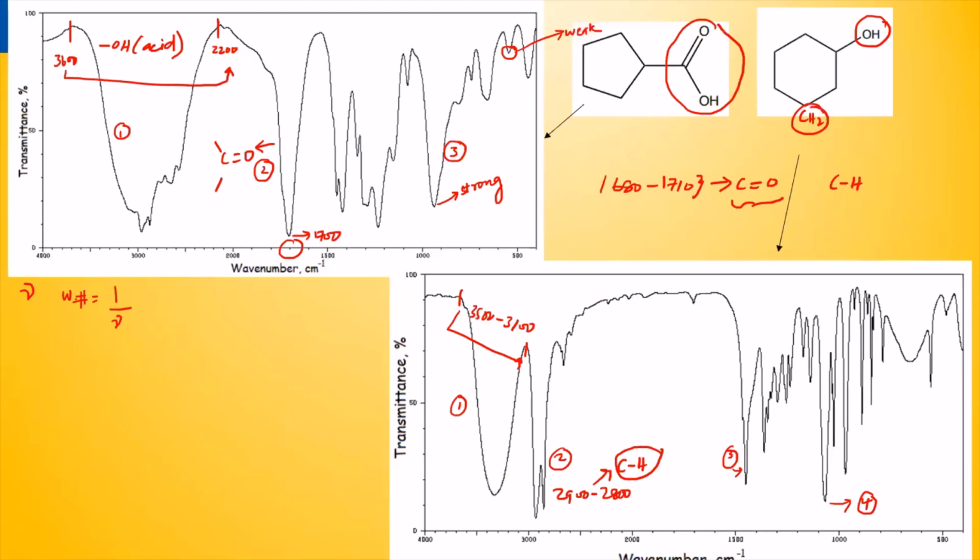It took me 10 seconds. I think I've said more since I've actually told you the answer, which I took literally the first 30 seconds of the video. I was already on the answer, right? So don't fluster. Again, peaks are listed as strong, medium, weak in the table. All you got to do is find 1 or 2 things that is usually common.